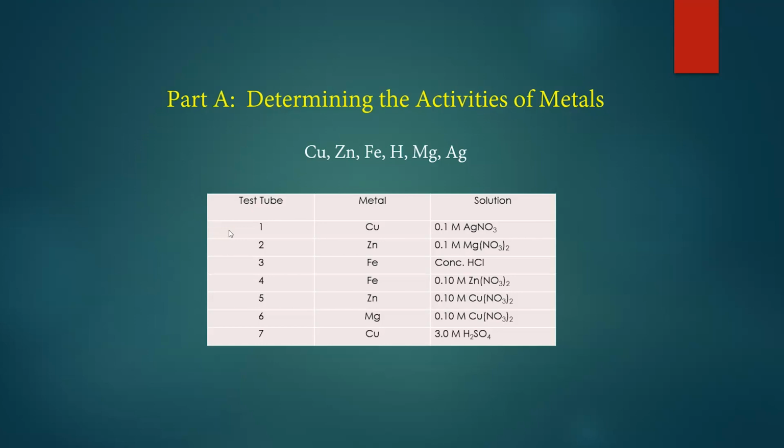Now, you won't actually be doing that since we're not on campus right now. So I've done each of these 7 reactions and made a video of each one, and those videos will follow this introduction to the lab. So you're going to carry out each of these 7, and remember, I mentioned earlier that only 4 of them are actually going to react and 3 of them will not.